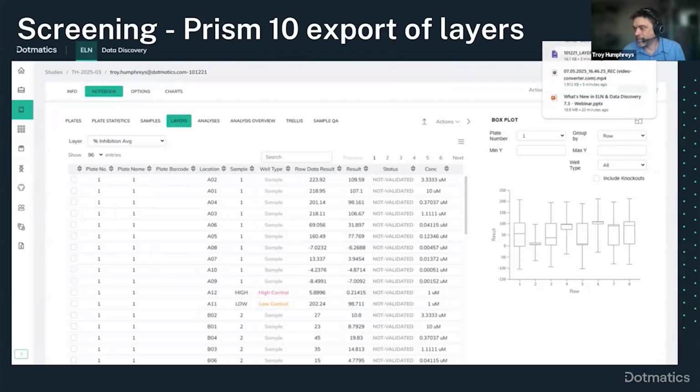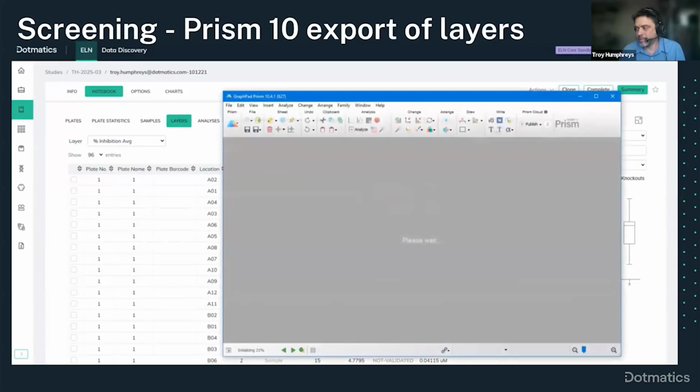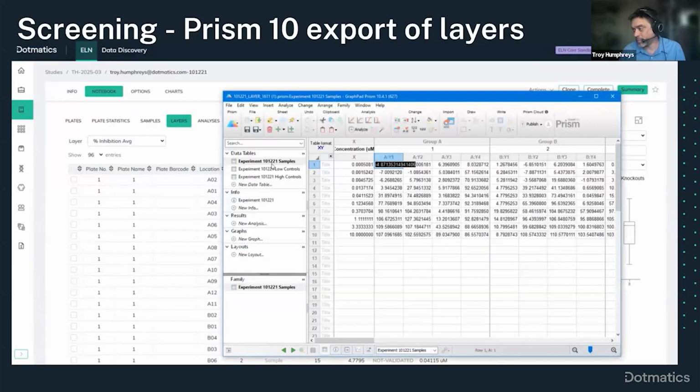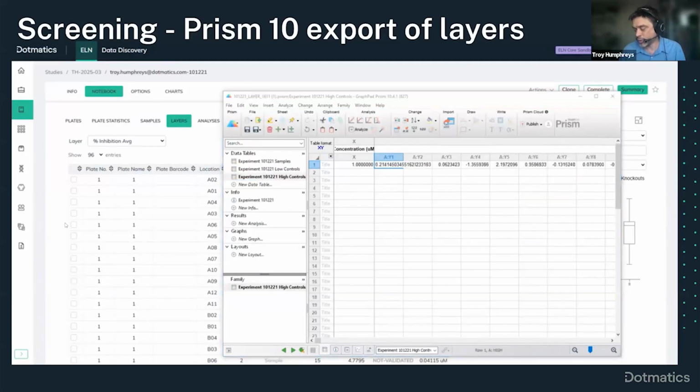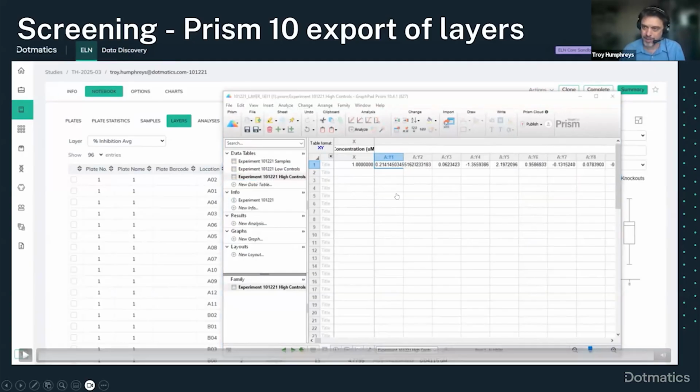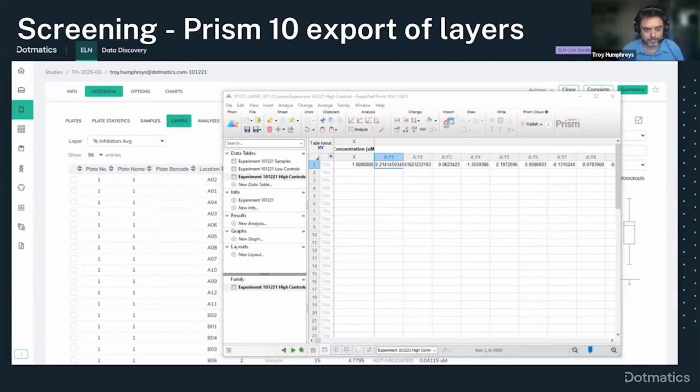And here you'll see that XY table for samples with the replicates grouped. Here I've got 4 replicates across my 8 different samples and separate tables. Now you can see that the controls don't often have dilution series with them, unlike samples. Another good reason for putting them into separate tables.